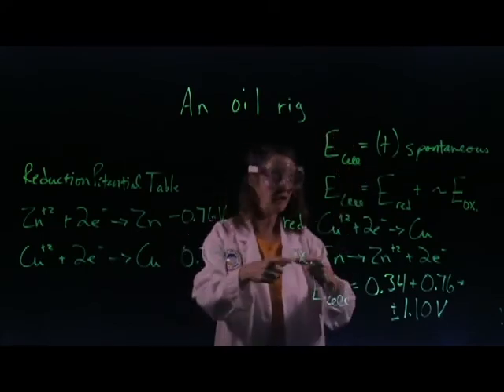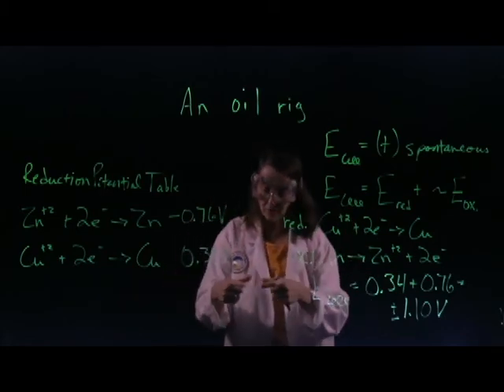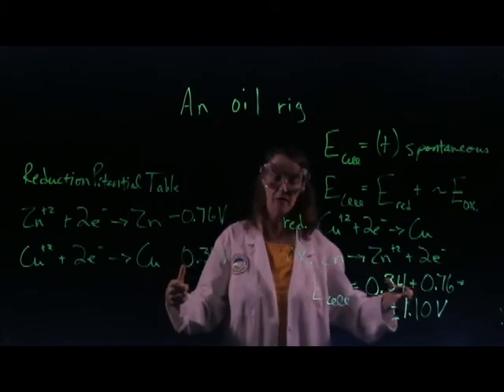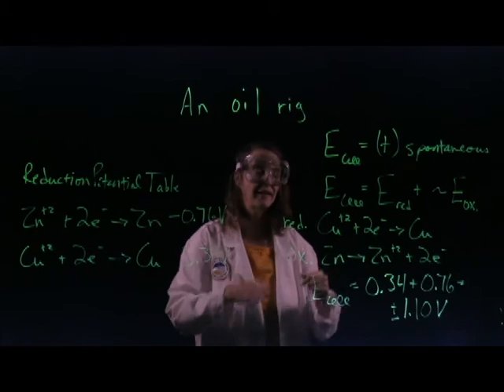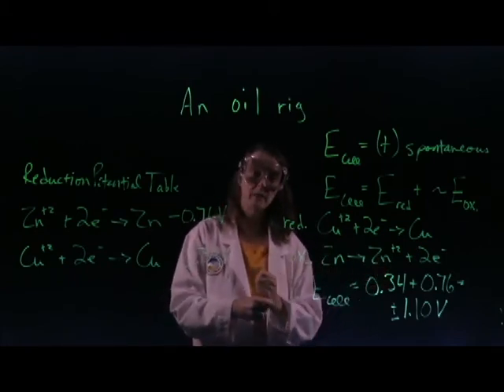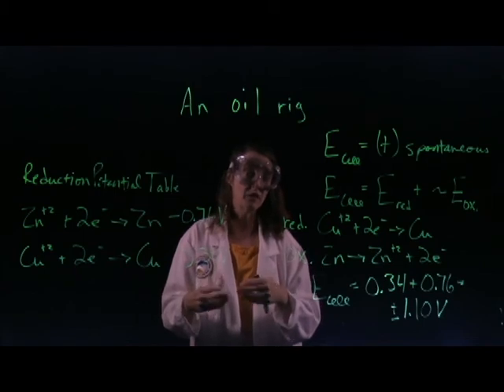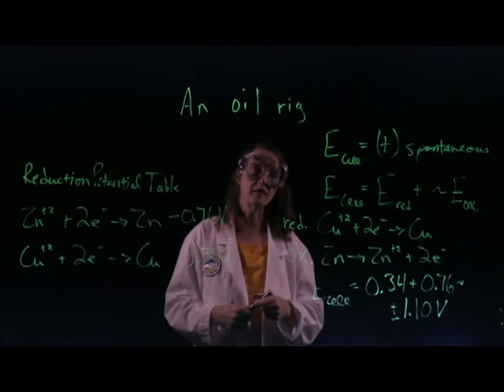You are looking at these different metal combinations in the lemon cell, and then after that, you'll combine different lemon cells to add these voltages together. For example, if you hook together 3 different lemon cells, you should have 3 times the measured voltage, theoretically. Usually, experimentally, you measure less than what you could theoretically. You will also look at these reactions using vinegar as a salt bridge instead of a lemon, but you should have fairly similar results with that.